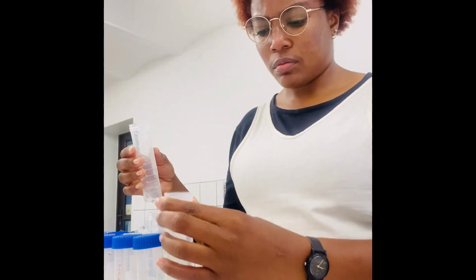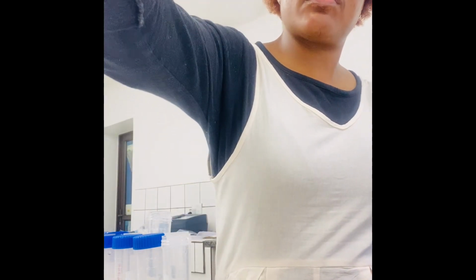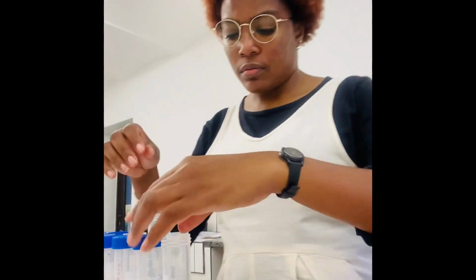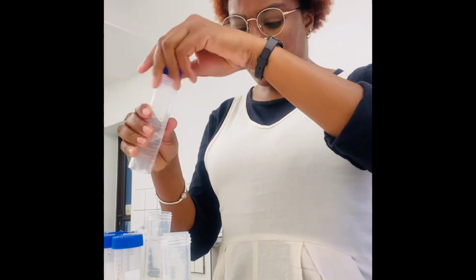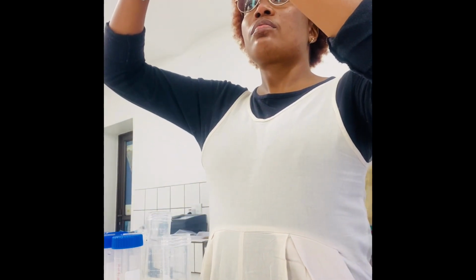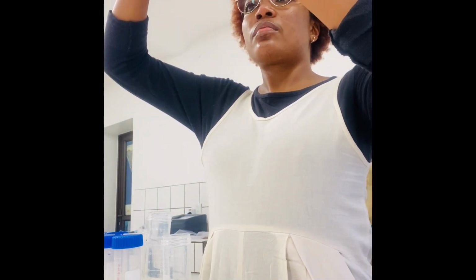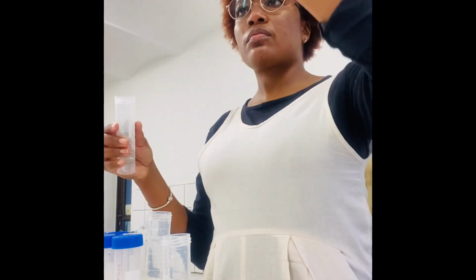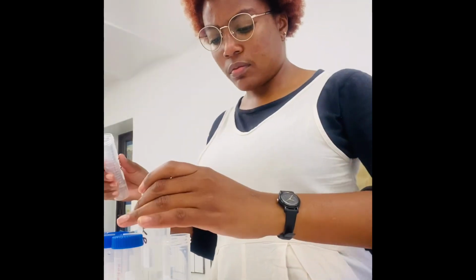The good thing about the machine is that it doesn't go beyond a certain level. If it does, it will say so, and it will give a warning in big red letters that it's over the measuring level. So it's set to what is expected in the water, for example in seawater.